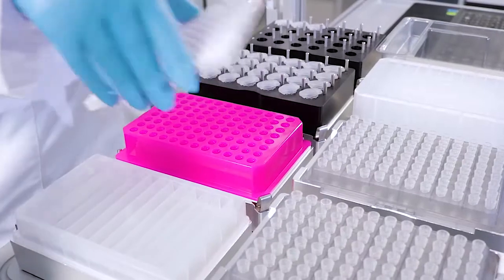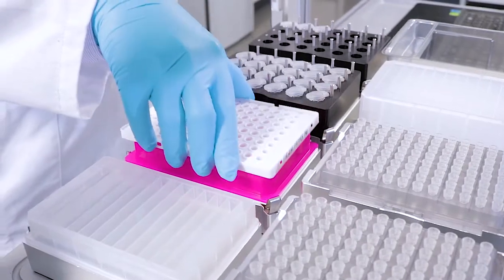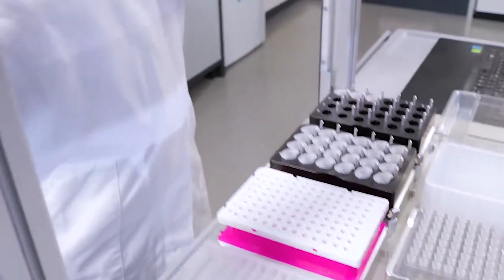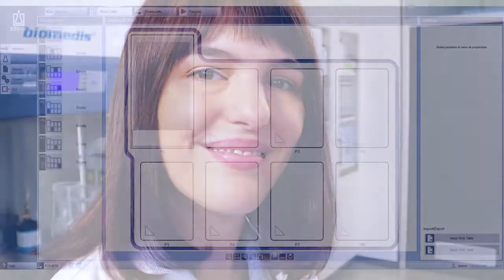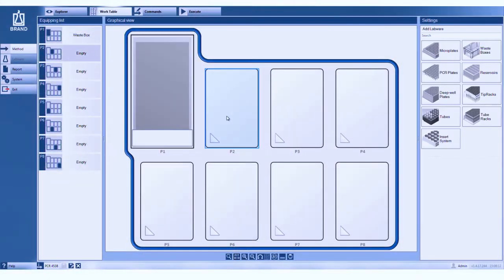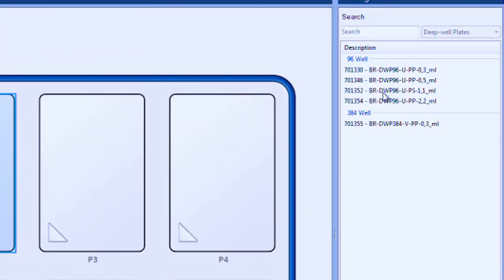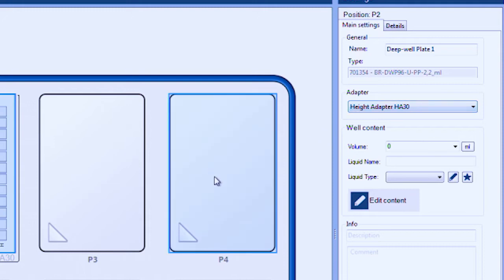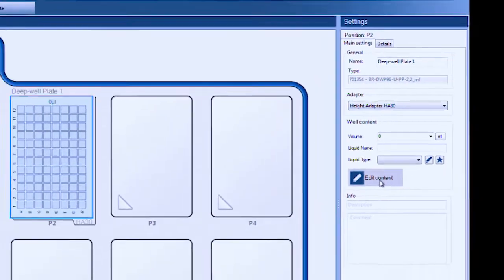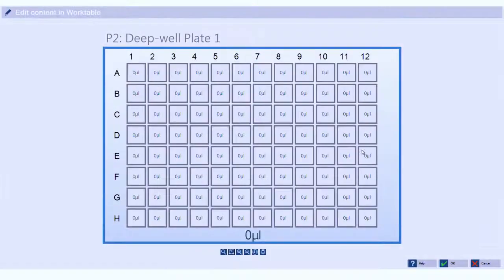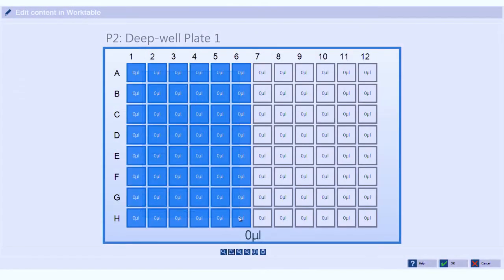The liquid handling station has seven positions you can freely use for your labware. Simply click on the position and choose your labware from the database. Then select the liquid type. It's as easy as formatting cells in a spreadsheet.